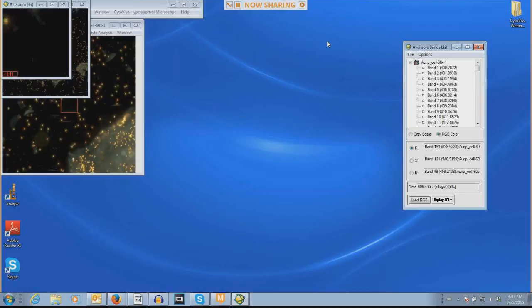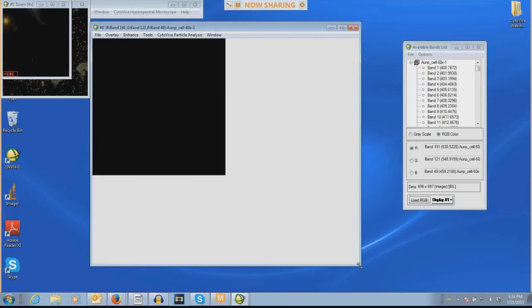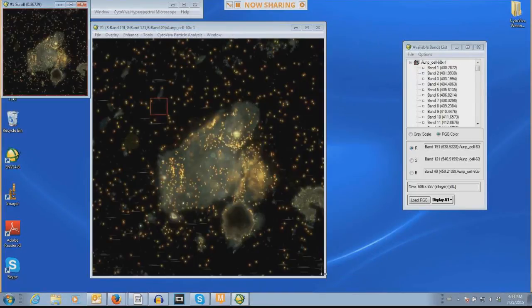For example, you would collect many spectra from a particle of a certain size, let's say a 50 nanometer gold particle. You would collect many spectra from these gold particles and save them into a spectral library file. Then these spectra would be searched for in other areas to look for spectral matches. And we'll go over some of those routines that do spectral matching later, but we're going to start from scratch here and just sort of start with building a region of interest and getting mean spectra and then going to a spectral library. So here I'm going to use this cell with gold particles as an example again.